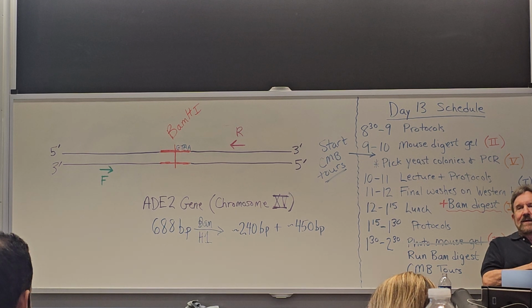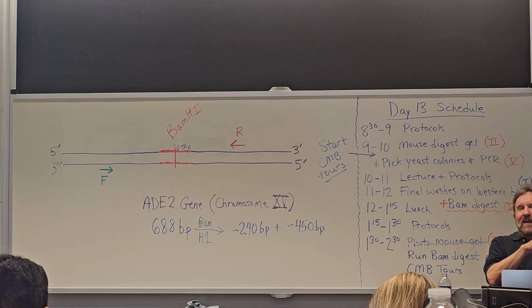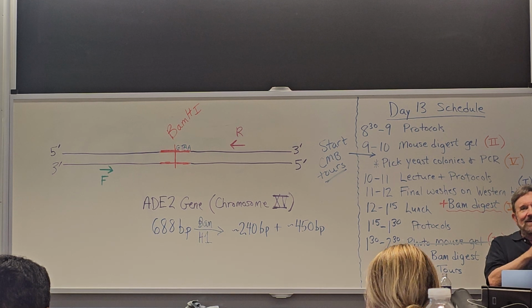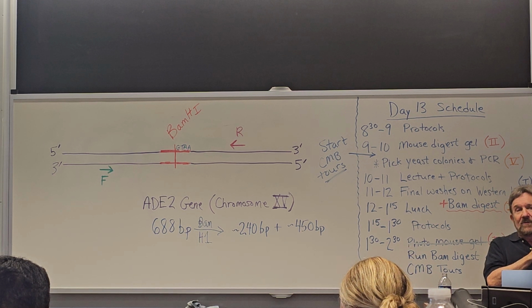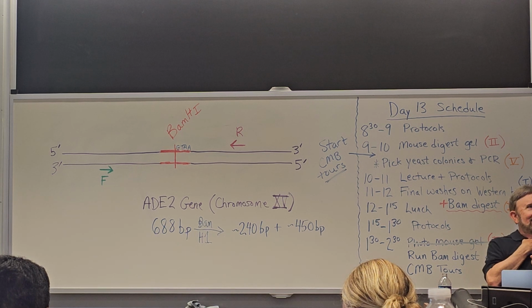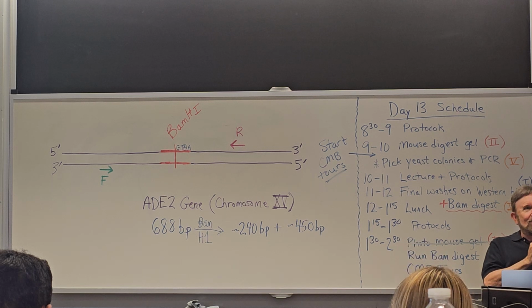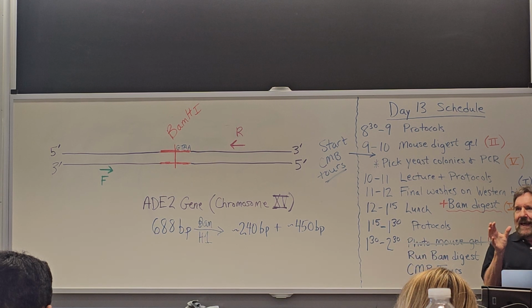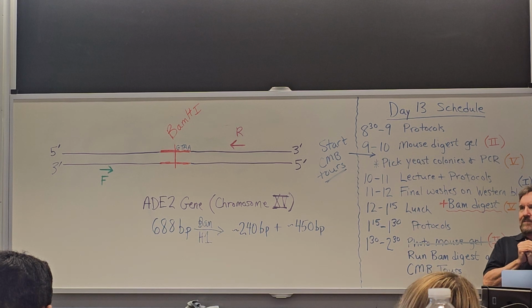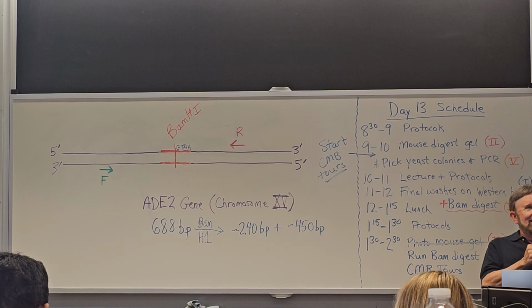And I know that picking that many colonies or that many cell lines and sequencing them sounds like a lot of work, and it is, but you have a high payoff because then you've got what you want, you've got that cell line now, you can keep it forever, right? Okay, any questions about that?